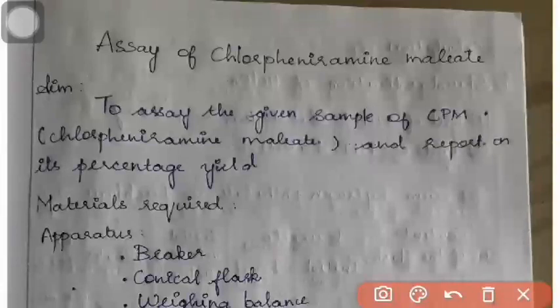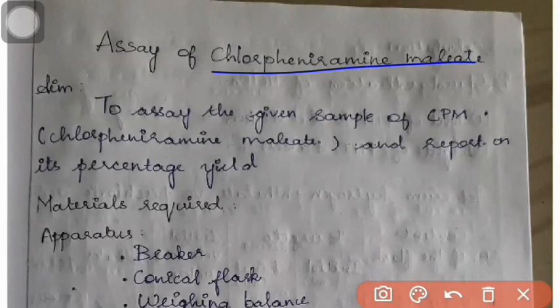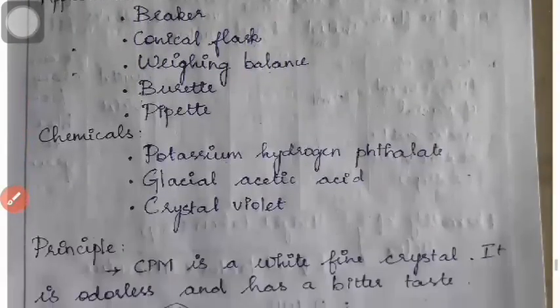Assay of chlorpheniramine maleate can be done by using non-aqueous titration principle because it is a weak amine, or otherwise a very weak base in water. Therefore, it is required to be titrated in a non-aqueous solvent, and for that we shall see its basic structure.